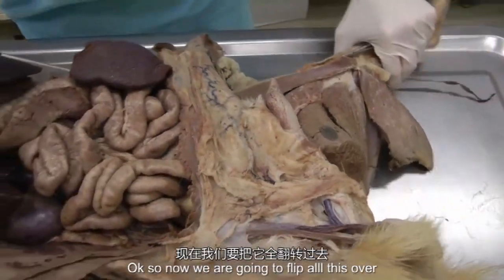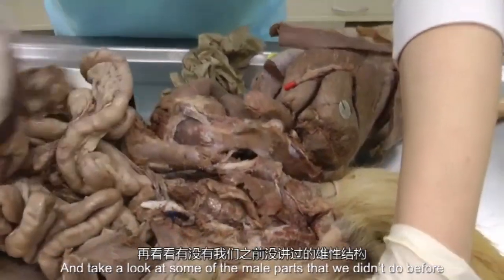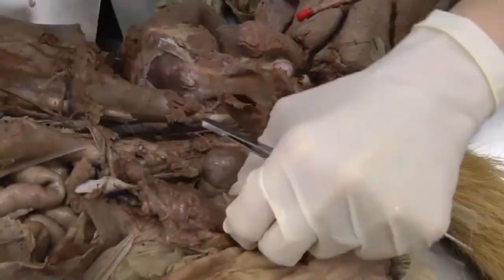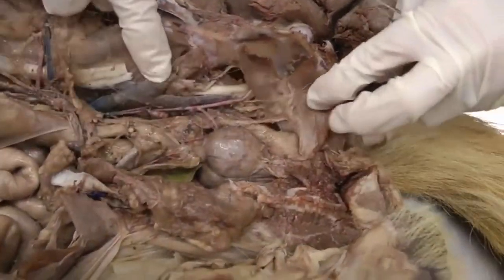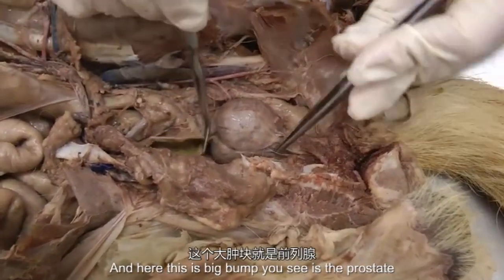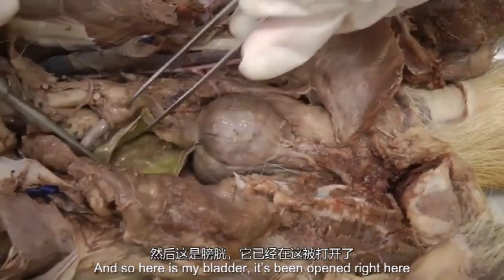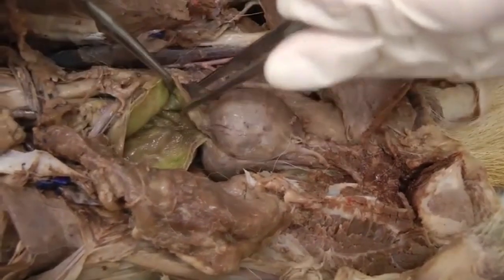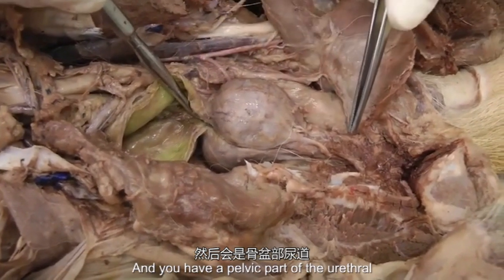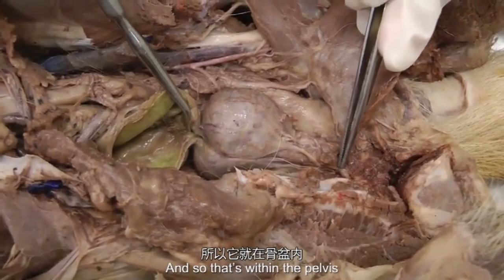Okay. So now we're going to flip all of this over and take a look at some of the male parts that we didn't do before. So here we're in that pelvic cavity again. And here, this big bump that you see is the prostate. And here is my bladder that's been opened right here. And so the urethra begins here, and you have a pelvic part of the urethra. That will be between the probe and the forceps here, and so that's within the pelvis.